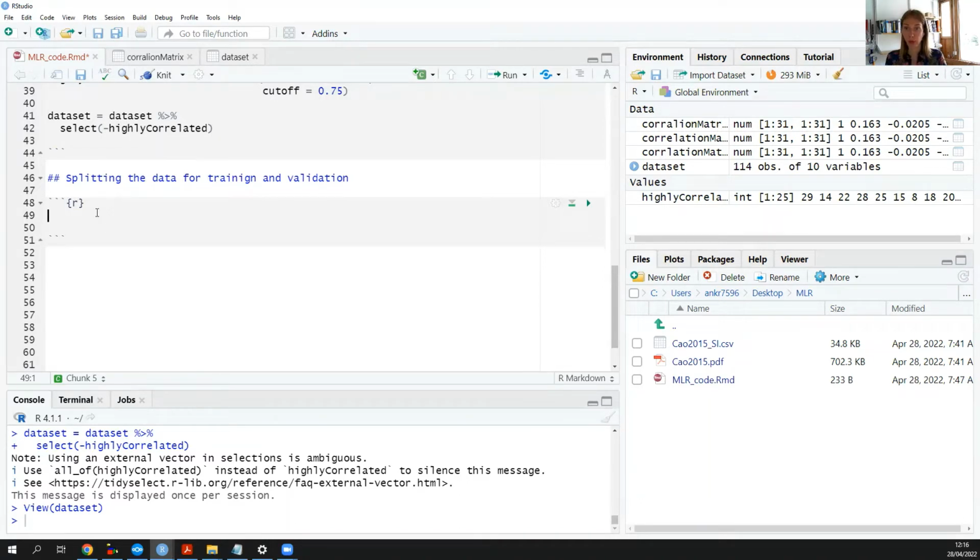So we will use the randomization algorithm from the caTools package, but because the random number generators behind the packages are using time as an input for generating random numbers, the randomization will be different now, in 5 seconds and in 10 seconds. This is a bit of a problem if we want to compare the results that we get now and in 3 months with the same data.